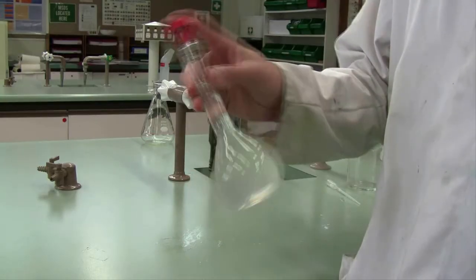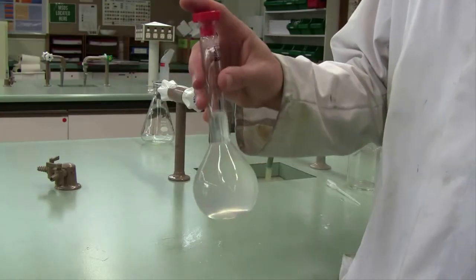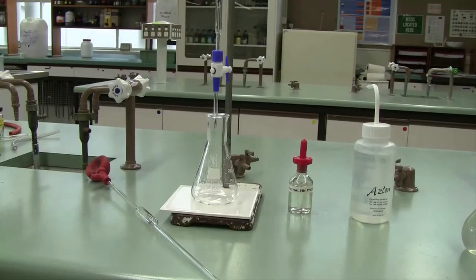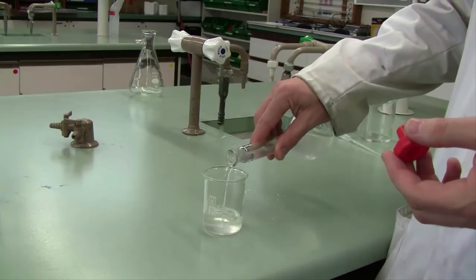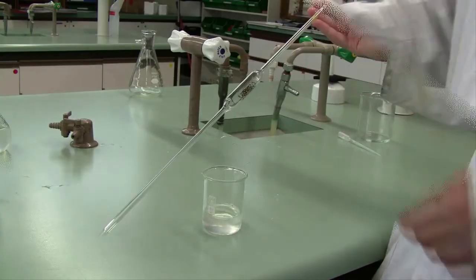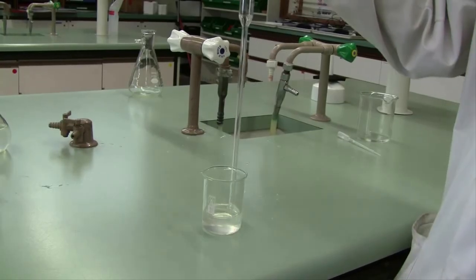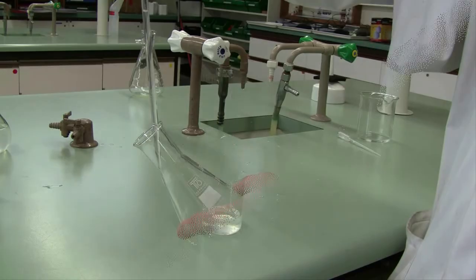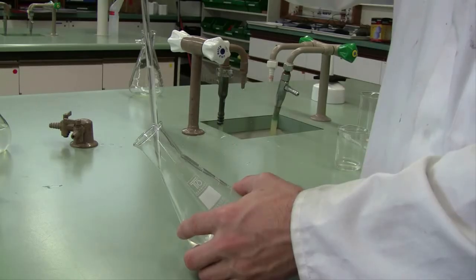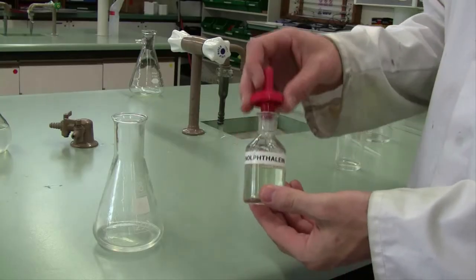Now we're ready to complete our acid-base titration. Pour a fresh portion of your diluted lemon juice into a clean dry beaker, then using your 20ml pipette — make sure you rinse thoroughly first, that's very important — take a 20ml aliquot and deliver it into a conical flask or titration flask. Do this four times, and then to each flask add two or three drops of phenolphthalein indicator, which will tell us when the reaction is complete.